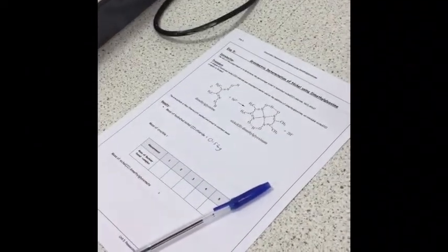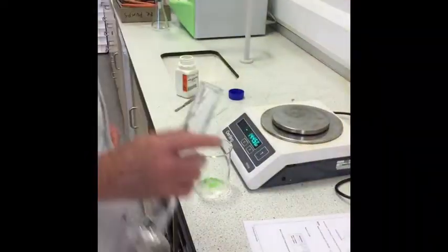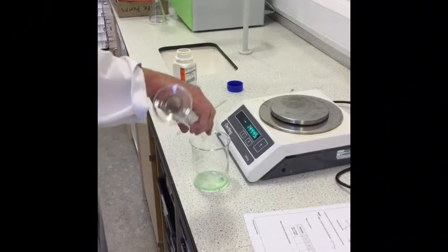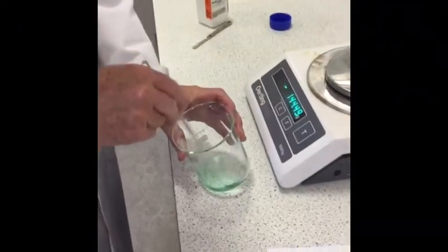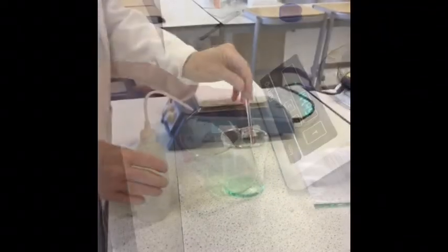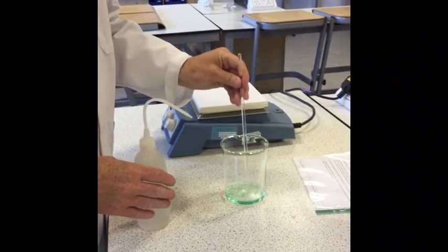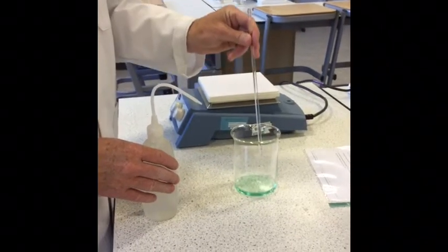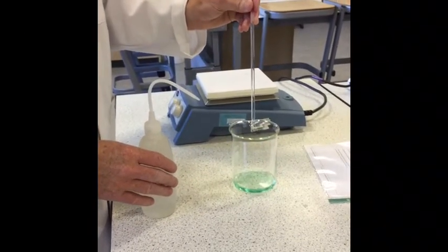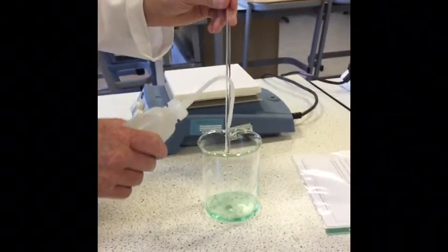and then what we want to do is add 20 cubic centimetres of distilled water and stir it until it's all dissolved. So that's it all now dissolved. Of course, this is a quantitative analysis, so we want to make sure we don't remove any of the nickel chloride solution in our glass rod. So let's wash down our glass rod.